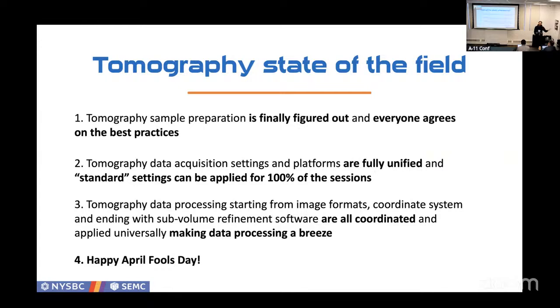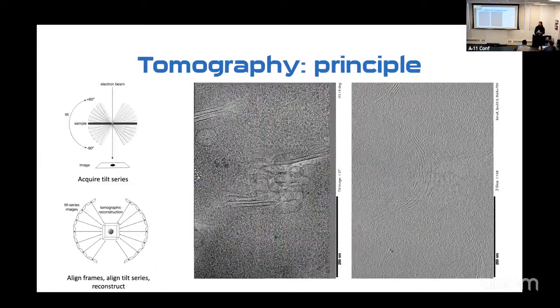Another way around, if you know what you want to get in the end, if you know the answer, or at least how the answer should look like, this will influence how you're setting up your session, how you're setting up your processing, and how you're setting up your data acquisition. So I'm more experienced with data acquisition. But this is sort of what you want to get in the middle of your data acquisition.